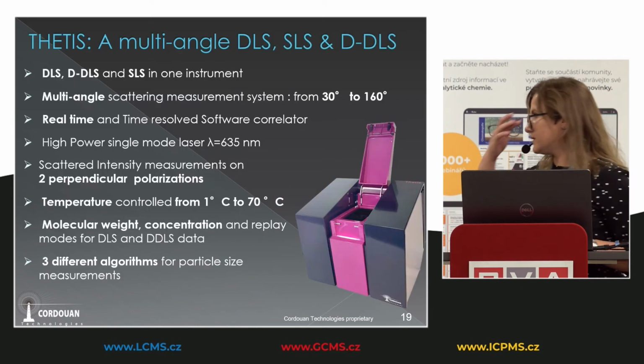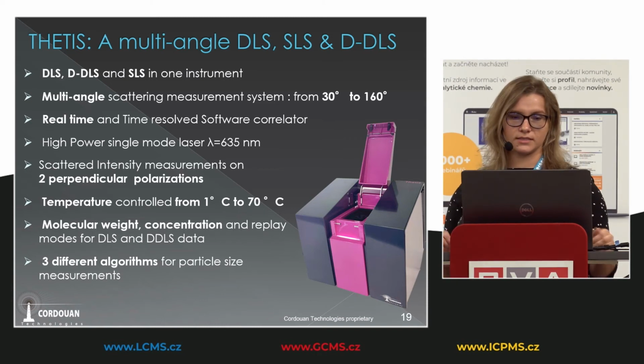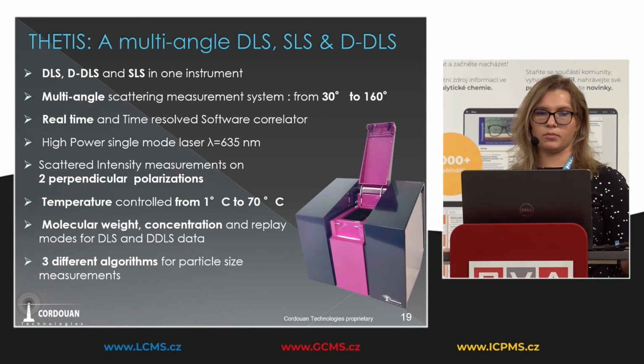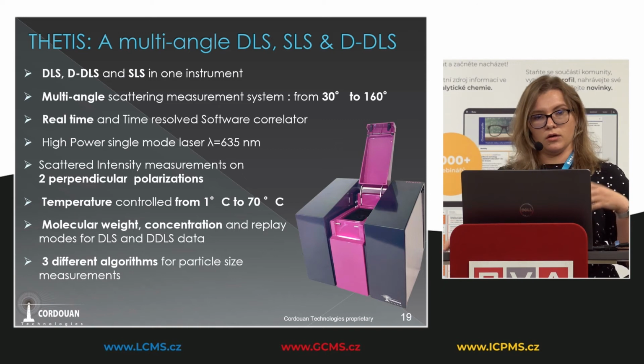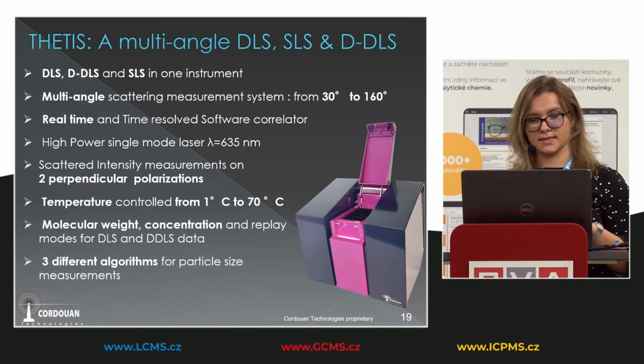So the Thetis, the multi-angle DLS and SLS device, which means dynamic light scattering, depolarized dynamic light scattering, and static light scattering, is the device which is able to detect the size of spherical nanoparticles, of anisotropic nanoparticles, and the bar diameter of the nanoparticle or molecular weight of your polymer, for example, without preparing a calibration solution, since it has access to different angles.